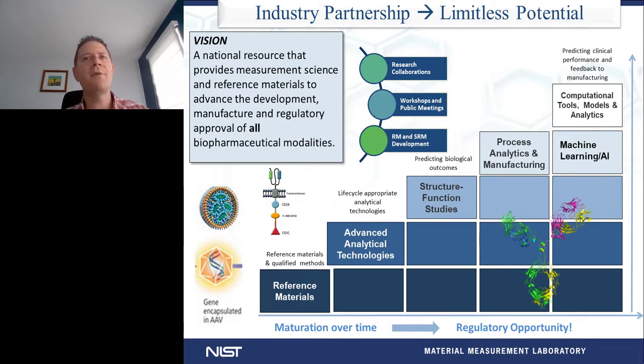So sort of a conclusion on NIST's current and future state. Obviously, we've done a lot of work with monoclonal antibodies over the past 8 or 9 years. Glycosylation analysis, mass spectral libraries, you name it, there's been a lot of measurements done to support the biopharmaceutical, specifically monoclonal antibody field, going from reference materials and now all the way up into the process analytics in the upper right-hand side. And with that, we'd like to continue to look at other modalities.